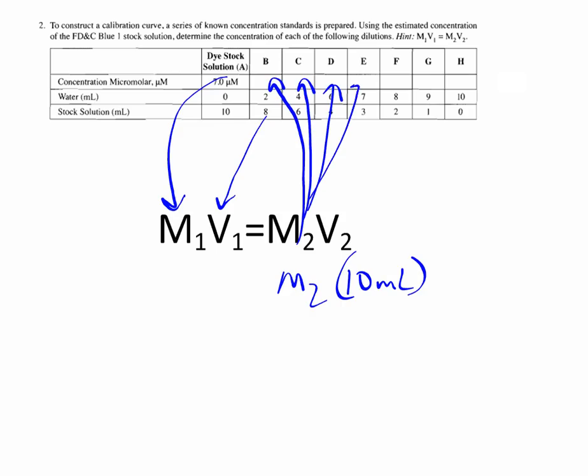So that's number 2 on the pre-lab. Number 1 asked you what a lambda max is. Lambda max is the wavelength of light where you have maximum absorbance. You'll fill this out in your pre-lab. Remember, the pre-lab always is done on a loose leaf piece of paper. You would recreate this exact grid or data table with a ruler, definitely with a ruler, or print it out and cut and paste it, whatever you want to do, onto a piece of loose leaf paper.